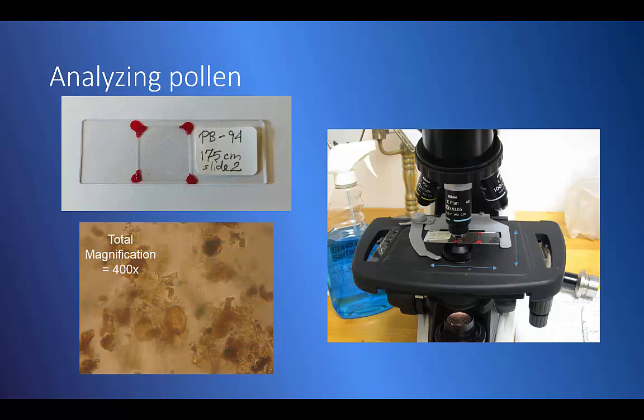The view itself tends to be a little cluttered because many kinds of organic remains make it through sediment processing. I can focus up and down a little to look past some of the other organics and to make out different features of the pollen grains. It takes practice and study to distinguish them.